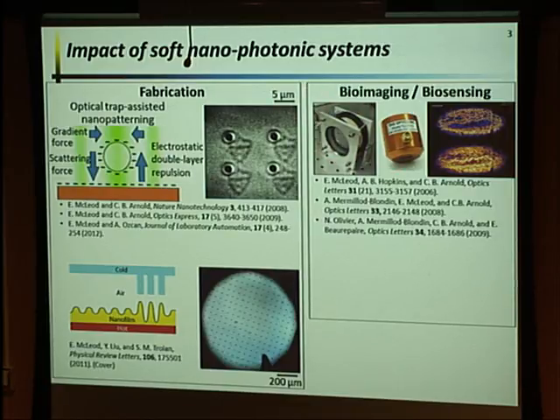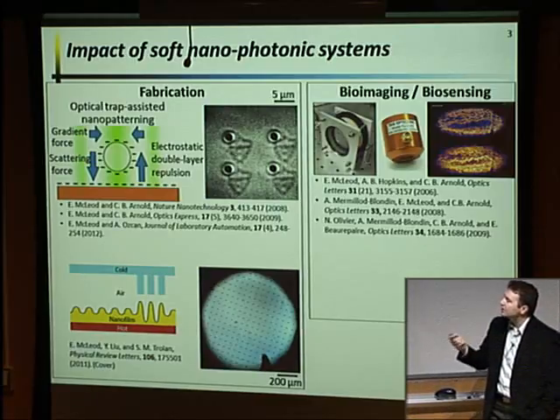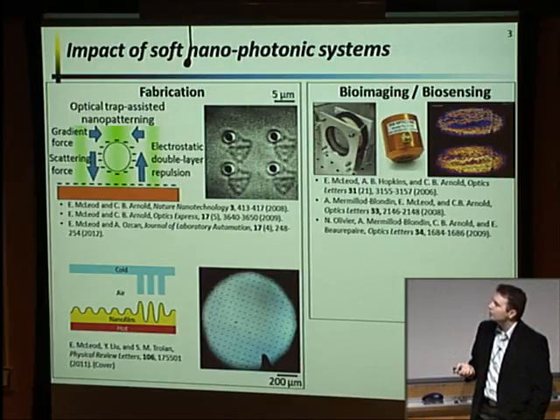This is another example from some previous work where we're looking at creating an adaptive lens. So this is a lens. It's a cylindrical chamber filled with a liquid polymer, silicone oil in this case. And we have a piezoelectric around the end, which is sending vibrations through this liquid. These vibrations are causing lensing effects through the liquid, and then you can combine this with other lensing equipment, other imaging equipment, in order to image specimens.